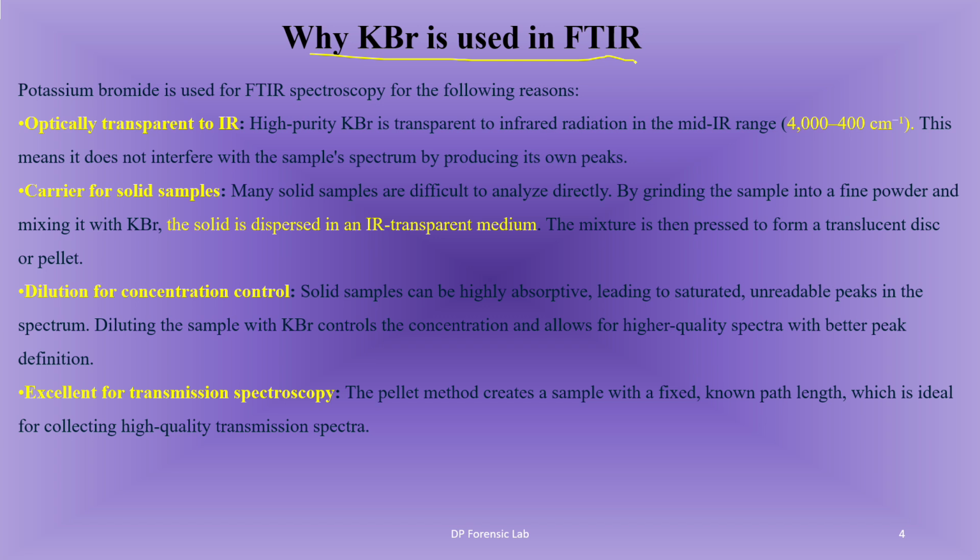Because it is optically transparent to IR. KBr is optically transparent to IR, meaning the IR will pass through the KBr. KBr doesn't stop the IR signal.